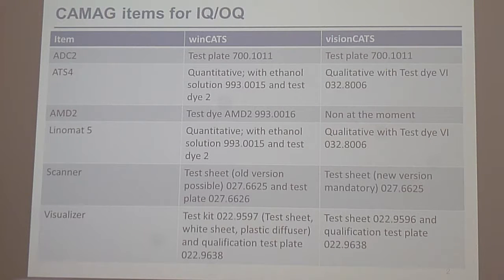So the thing is, what we are looking for is to have almost the same standard for all, so that we can use one standard, and you can order this standard, and then you have it once, and then you can use it maybe in half a year. So you don't have to order for every IQOQ, but then you have it, you have a certificate from our side, and so you're on the safe side. So something like that is our target at the moment.